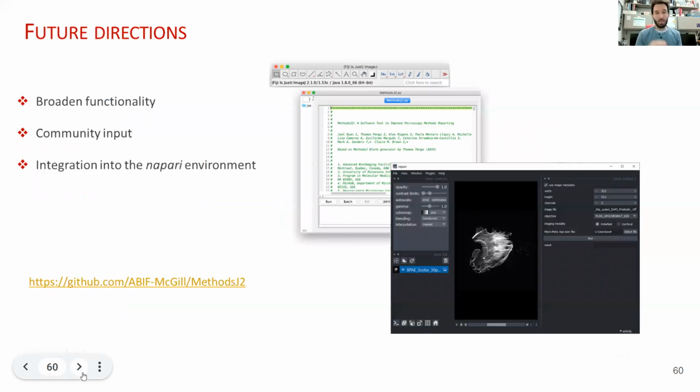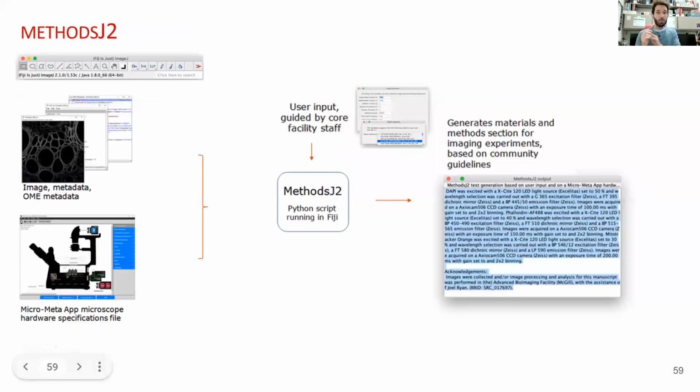That would be something along the lines of, images were acquired on a Zeiss wide field, with all the information that can be in there, and hopefully, as much as we can, we try to follow the guidelines as established in Paula's paper and as discussed by Paula a little bit earlier today. So that's the main of it. The script emits a little text blurb that is copy-pastable, and also, not shown here, a CSV file with all the input information that was either found by the script itself in the metadata or entered by the user.